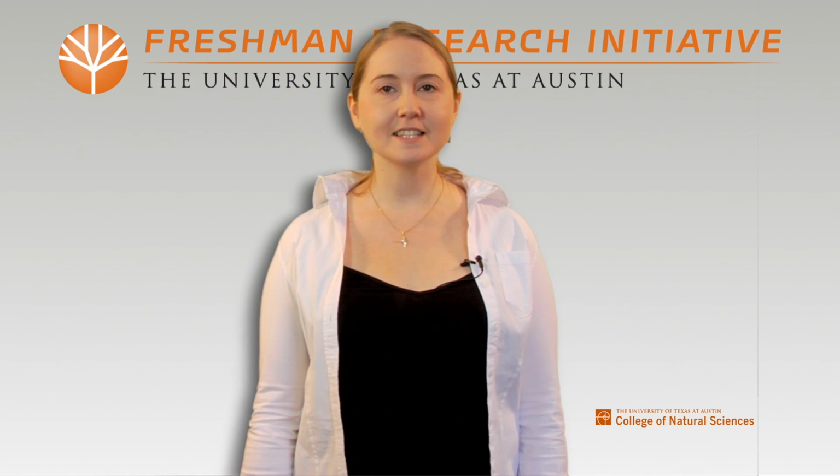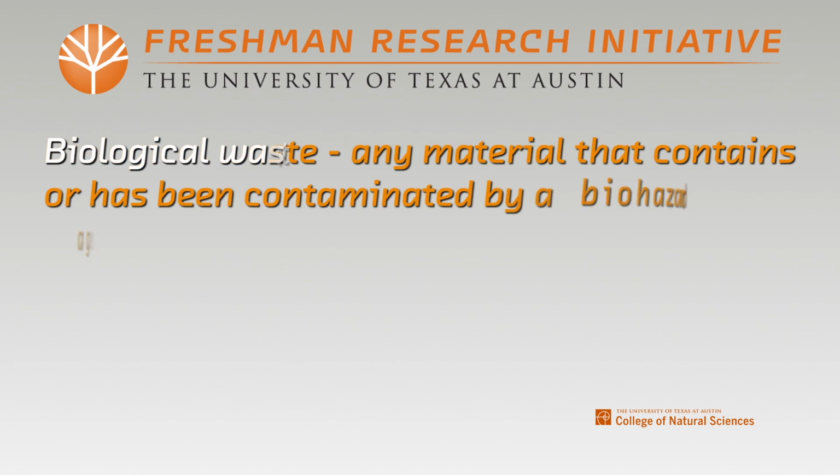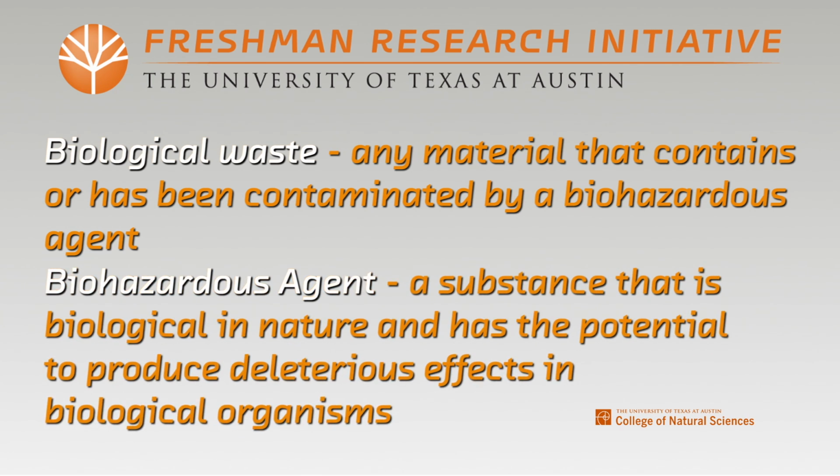In this video, we are going to introduce you to basic biological safety procedures related to handling biological spills and biological waste disposal. First, let's define some terms. Biological waste is any material that contains or has been contaminated by a biohazardous agent. A biohazardous agent refers to a substance that is biological in nature and has the potential to produce deleterious effects in biological organisms.